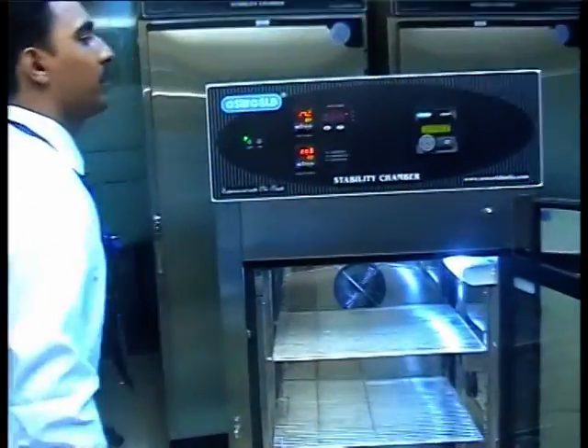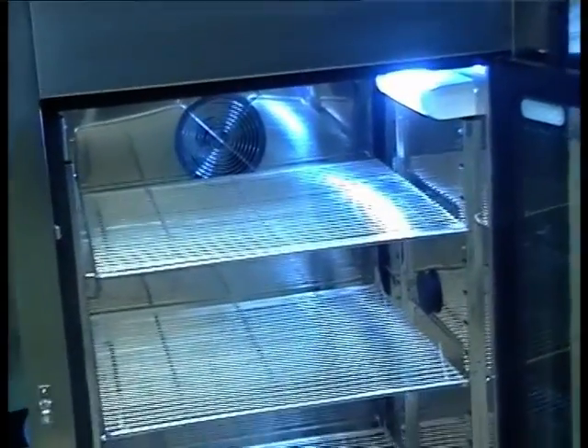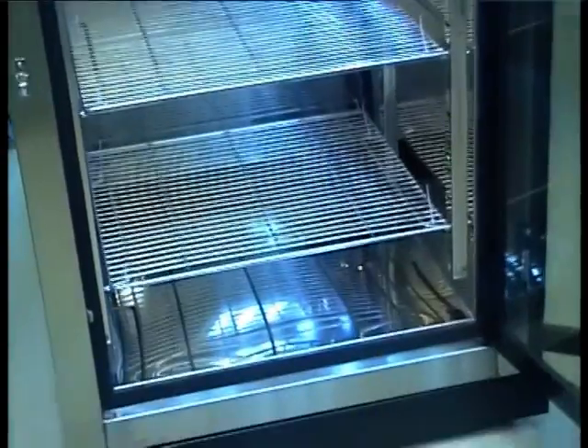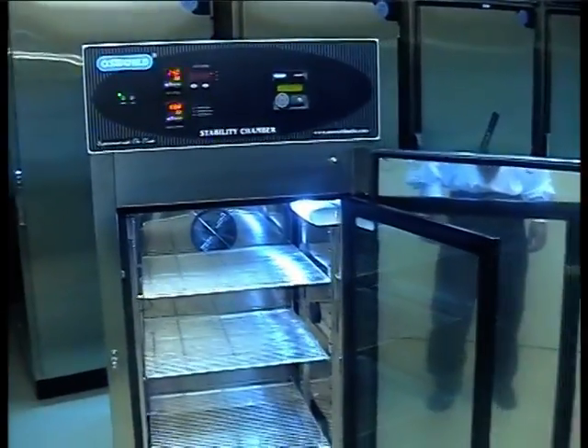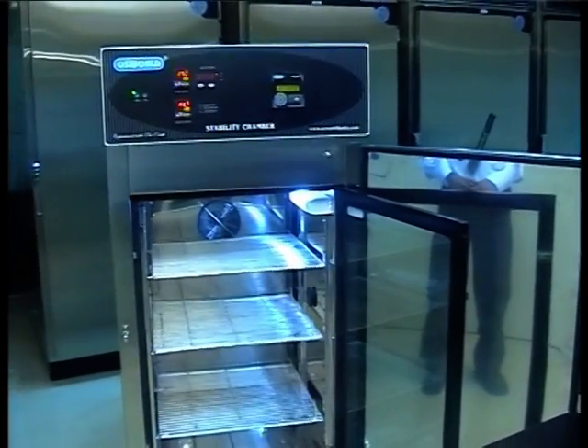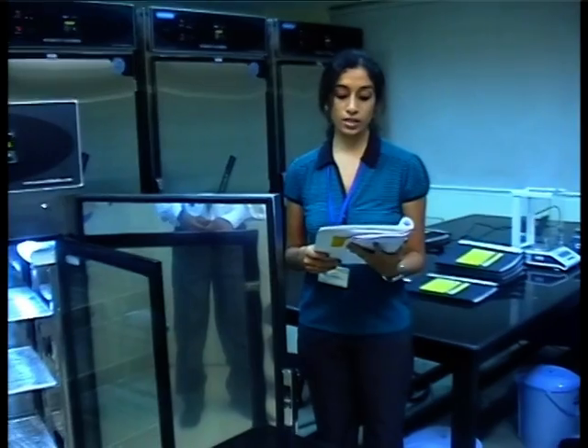Allow the equipment to run in this condition for 30 minutes. You will observe that the temperature and humidity controllers indicate the same value as the temperature and humidity existing in the room. With the help of a thermometer, you can determine the actual conditions of the room and verify if the stability chamber sensors are reading correctly.